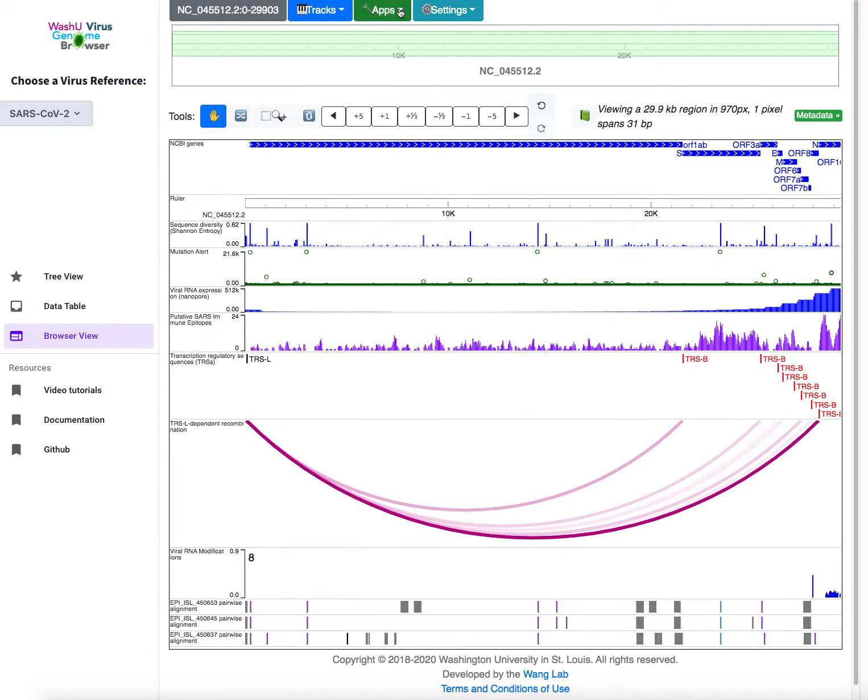To the right of this is another drop-down menu featuring several applications the user can use on the browser. These include the Region Set view, where the user can view multiple distant genomic regions in one view, various plotting options, session saving for resuming your genomic view at a later time, going live, taking publication quality screenshots, and obtaining the reference sequence for the genomic region in view.